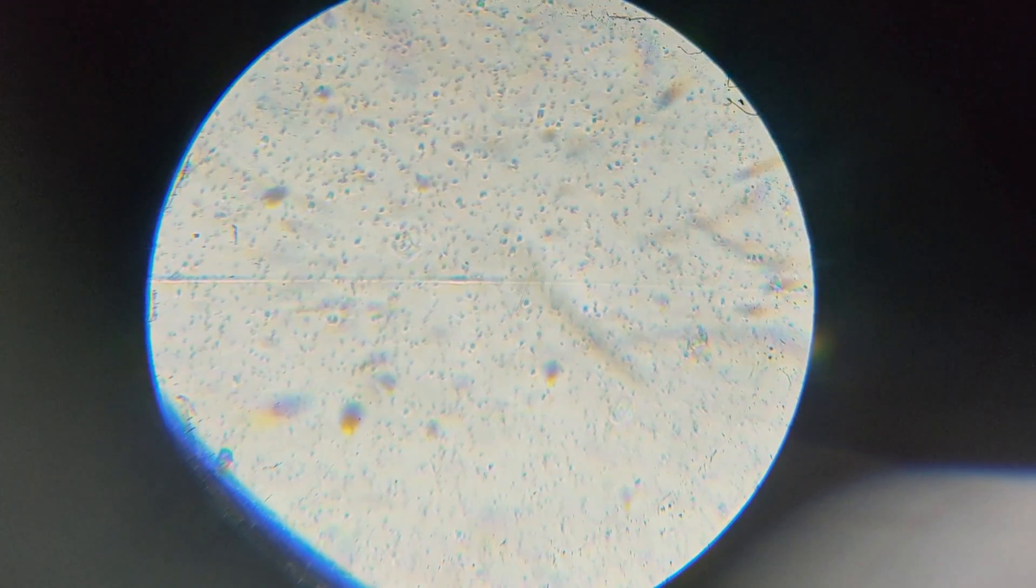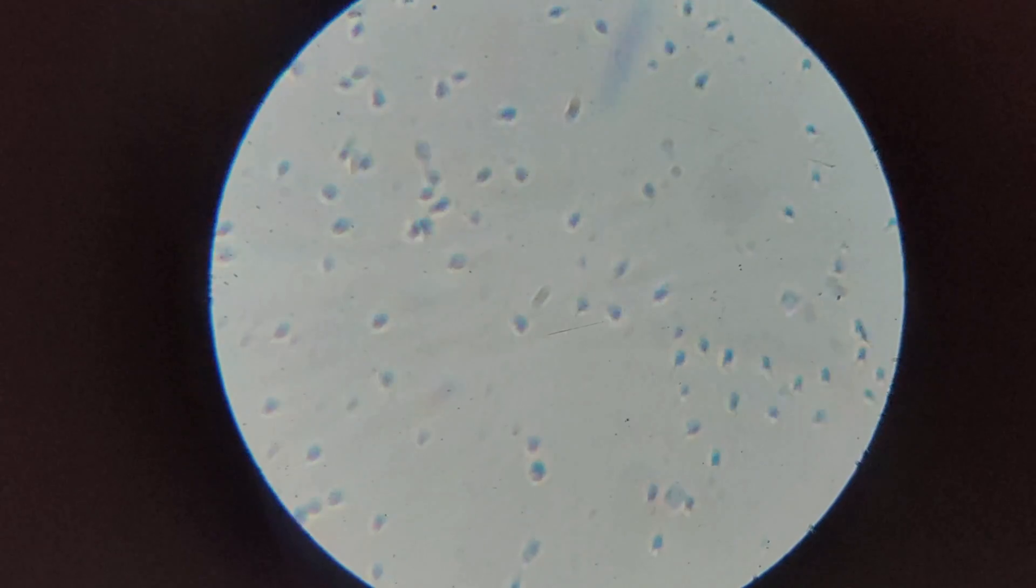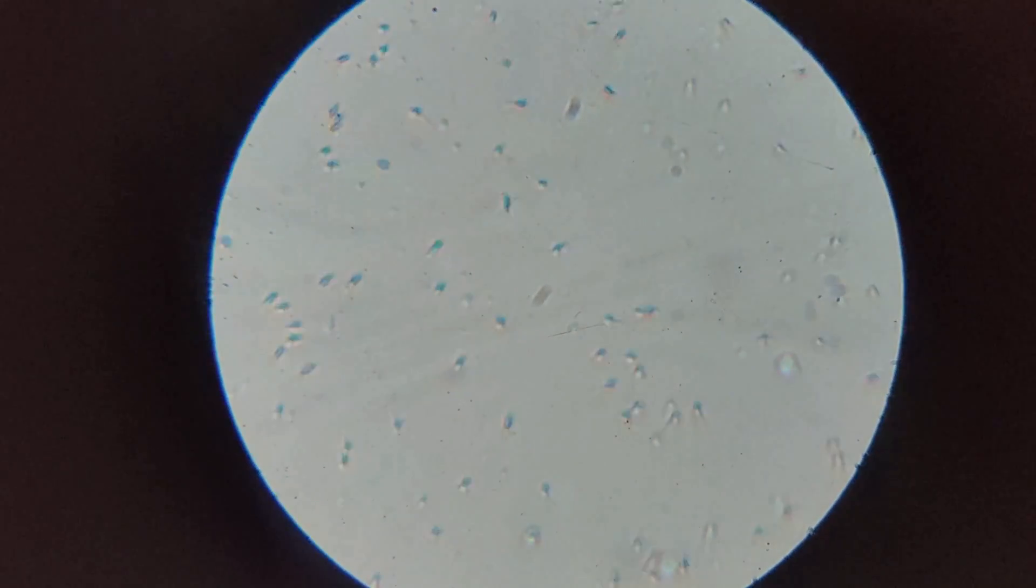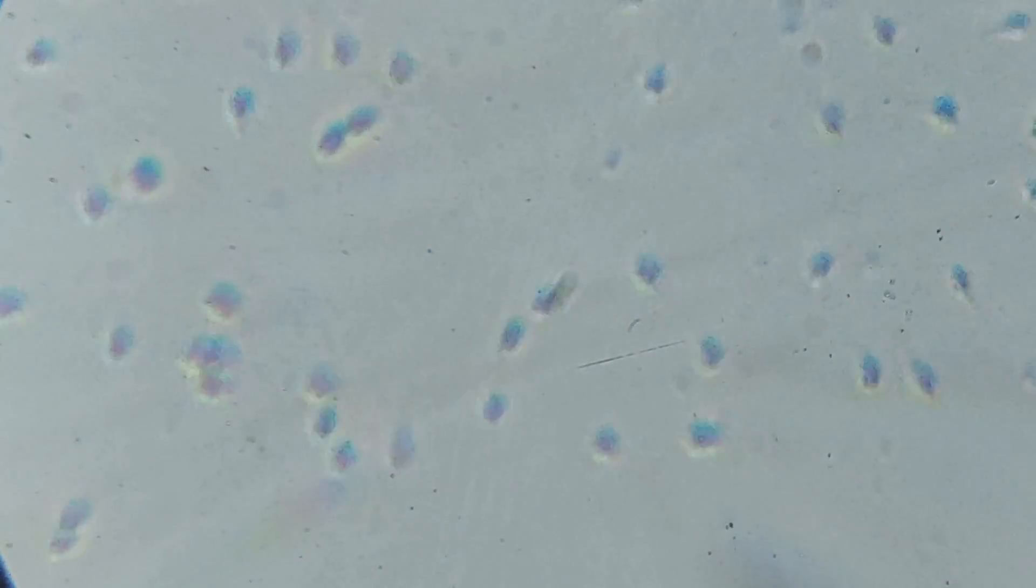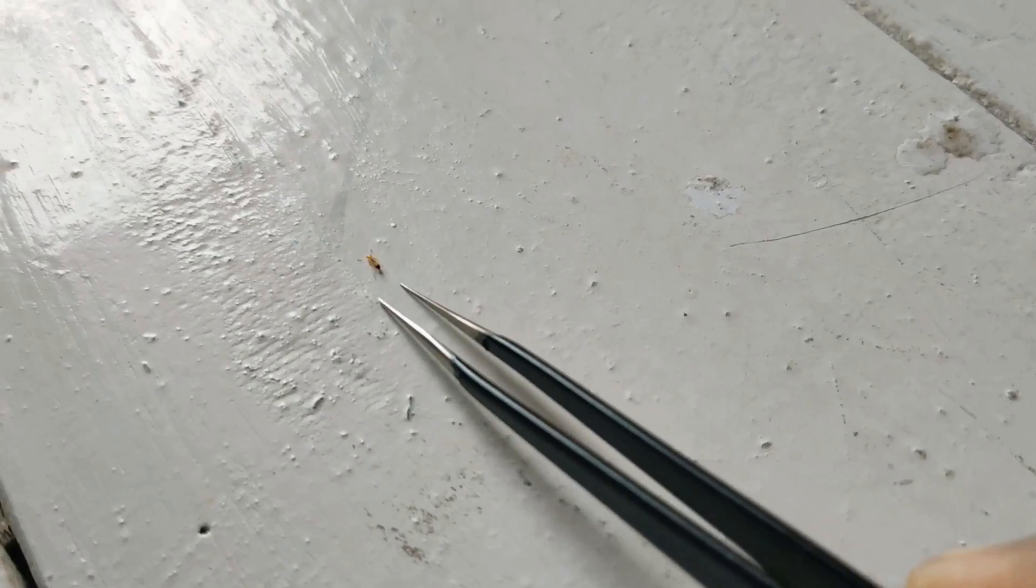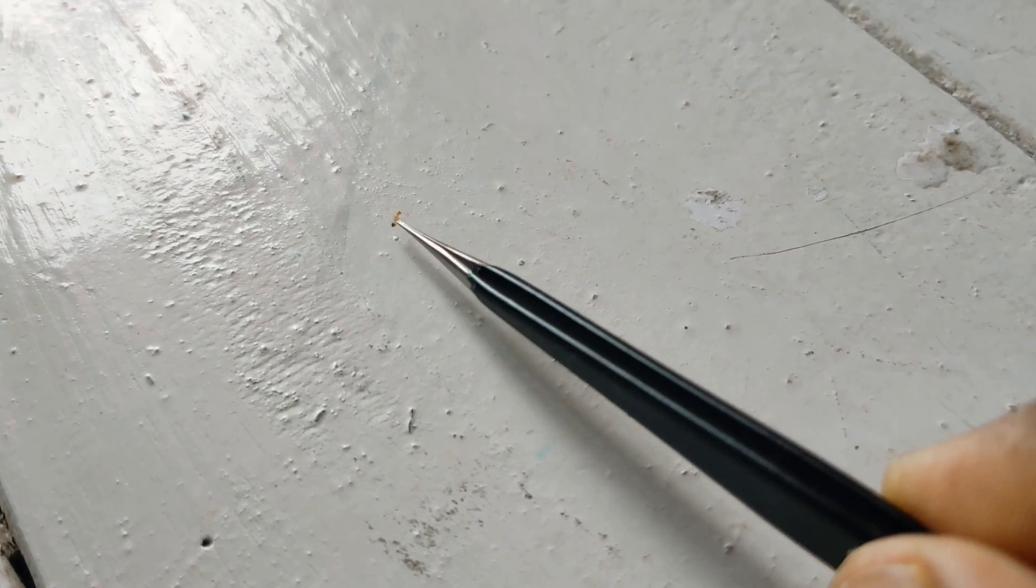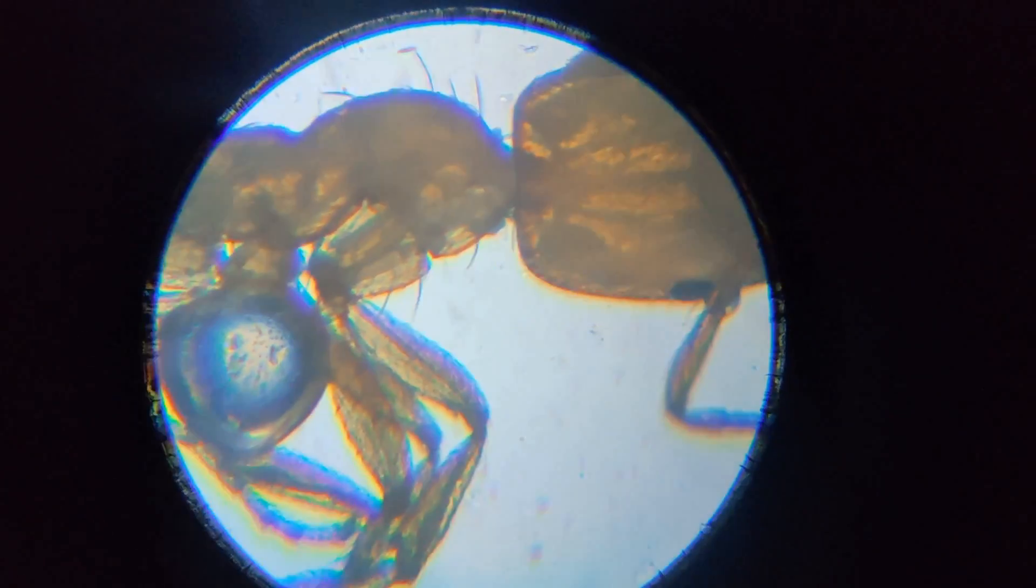Microorganisms in 100x zoom, 450x zoom - look how they are dancing! And 1000x zoom. Now the time for this little ant. Now with 100x magnification, watching through this microscope is really satisfying.